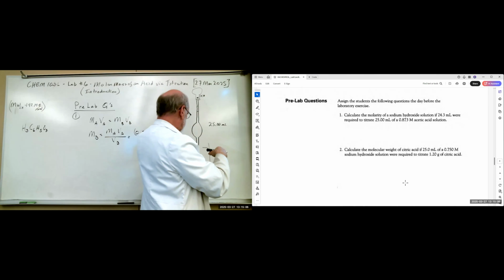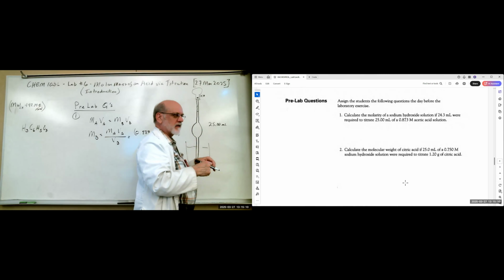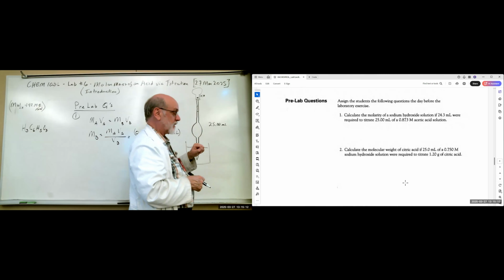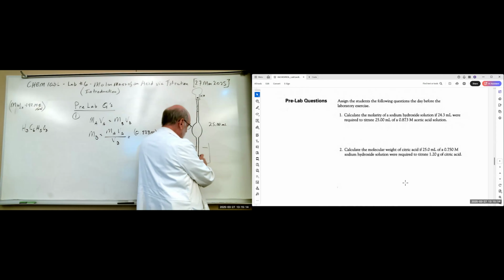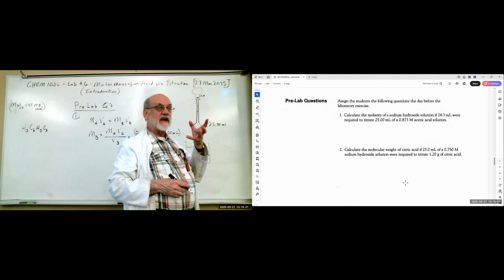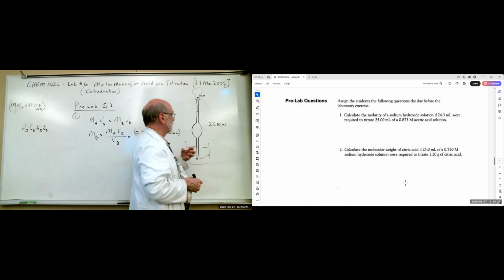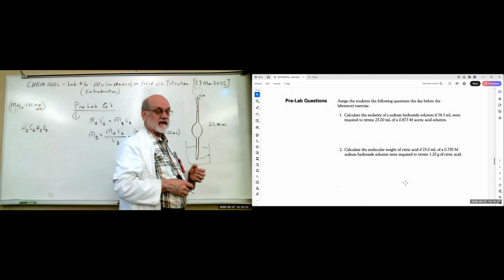Then it's still out, and you're draining into the container. Then you take another chem wipe. Actually, you don't take a chem wipe. You take this tip and you touch it to the inside up here, the inside of the container, just so that it wicks away any drops hanging on the end. Now you have exactly 25 milliliters in that container.